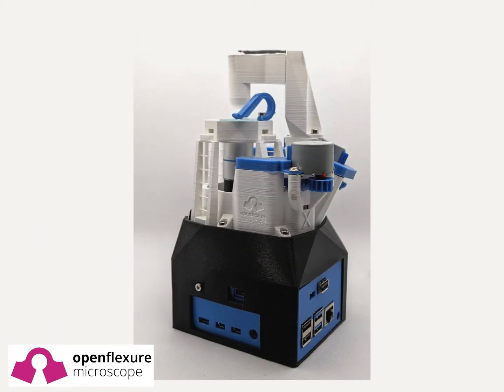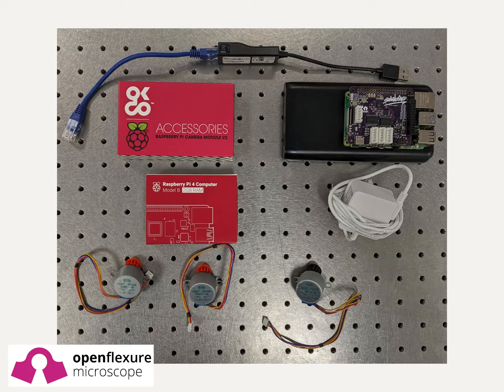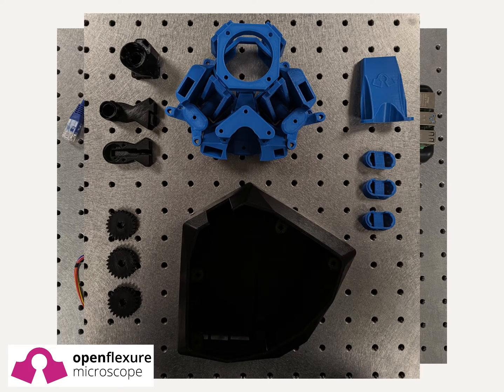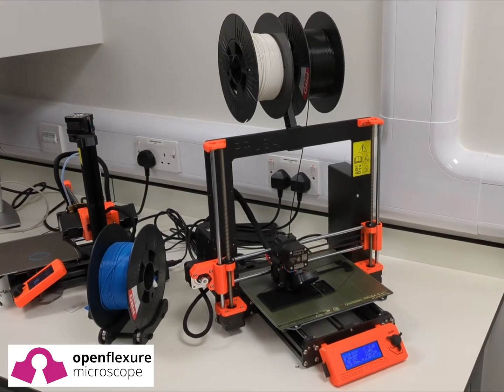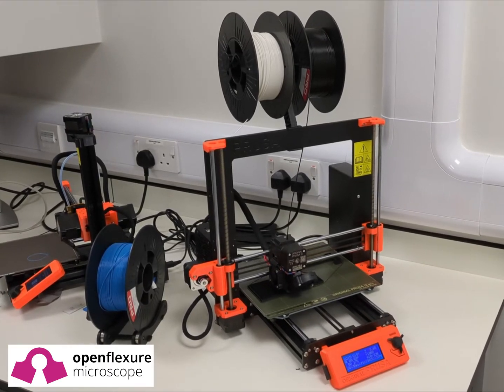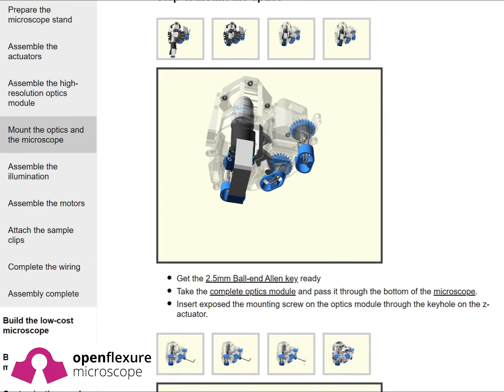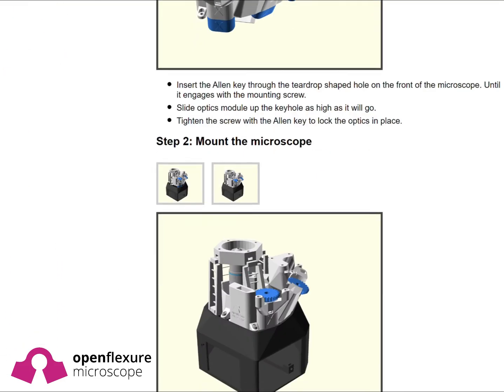An OpenFlexure microscope is built from a combination of off-the-shelf electronics, standard optical equipment, and 3D printed parts. The printed parts are designed to be made on any entry grade printer anywhere in the world. During assembly, our documentation guides the manufacturer through every step, allowing them to understand the position and the role of the illumination.